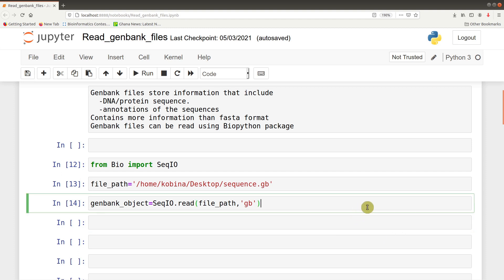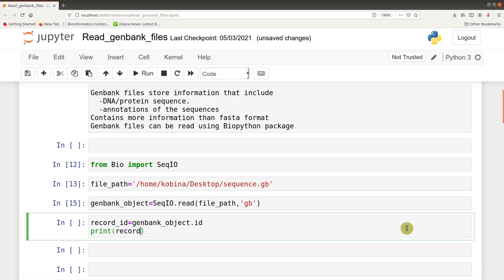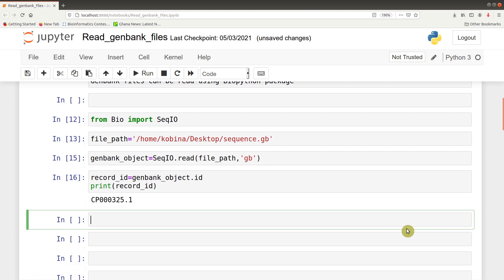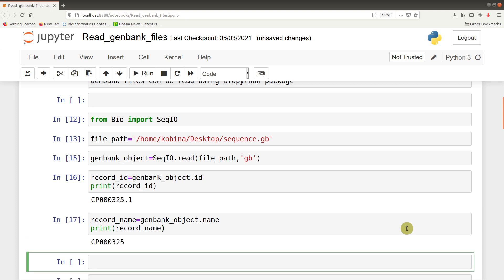So we have the GenBank file read and it's time to explore. There are a lot of things we can extract depending on your goal. We can query the record ID: record_id = genbank_object.id, then print(record_id). We can also query the record name: record_name = genbank_object.name, then print(record_name) to get the name.